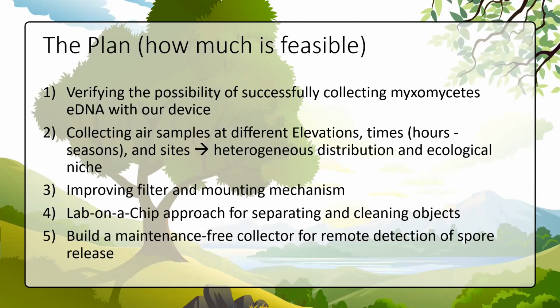In this experiment, when you tested 10, 5, 3, and 1 spore, how many species did you test? Only one. Only one. So it can be different for different species, maybe. Most likely. Yeah. It depends. My assumption, especially for the single spores, is that as you go down with the spores, the risk that you use a spore that is actually not working anymore, totally degraded, is quite high.